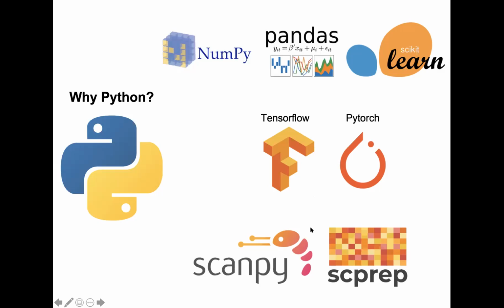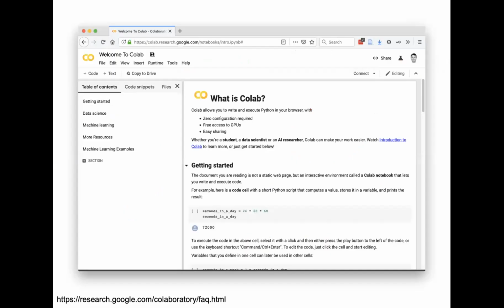And there are actually also really great tools for analyzing single cell data in Python. So ScanPy from the Theis lab and scprep, a software package from our lab, give you a lot of the similar tools that you might want from, for example, Seurat or different tools from Bioconductor, available in Python. We actually do all of our single cell analysis in the lab in Python and really encourage people to get their toes wet with that language.